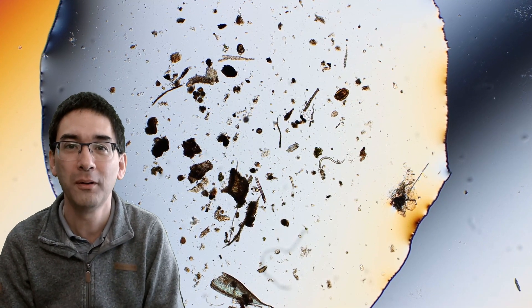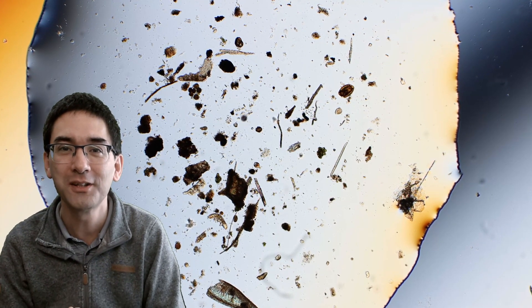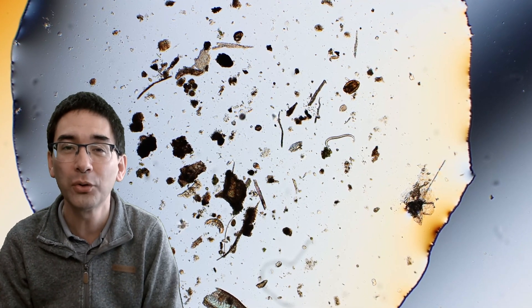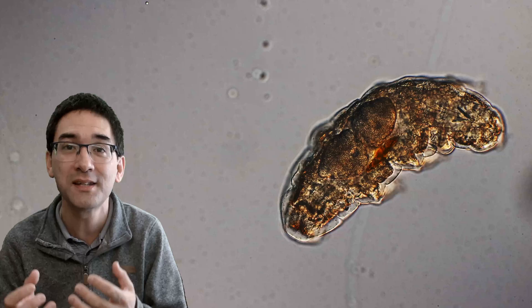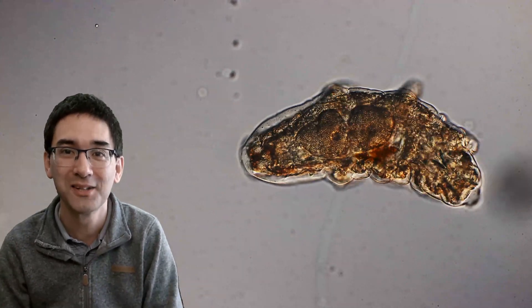Here, this here is a small drop of water, which shows that there's not only a tardigrade there, but also a few ciliates. And can you also find the nematode worm wiggling around? So all of those organisms must have somehow survived the dryness in the moss. And it shows that nature is quite resilient here.